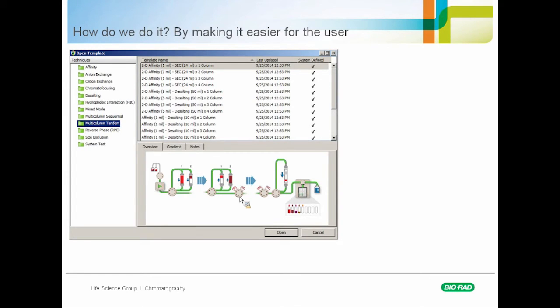There's also in the notes section a little place you can click on, and this is a useful tool really that just summarizes what's going to be occurring during the method. It gives you the system requirements of what components you would be needing for this, just to be able to clarify and visualize in your mind what's needed before you start the run.